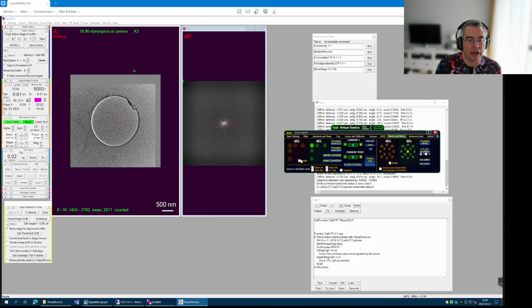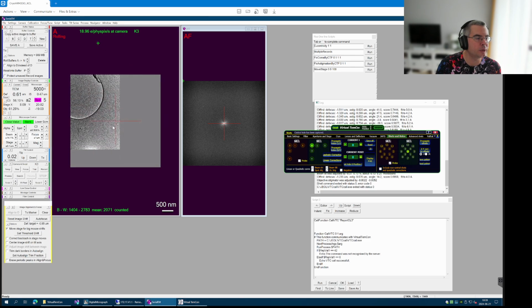So I have to untick this protect box, and I have to get hole 0. Central hole has been captured. This is what I want to see. Good. Then the next thing is to find holes 1 and 3. So let's look for them.